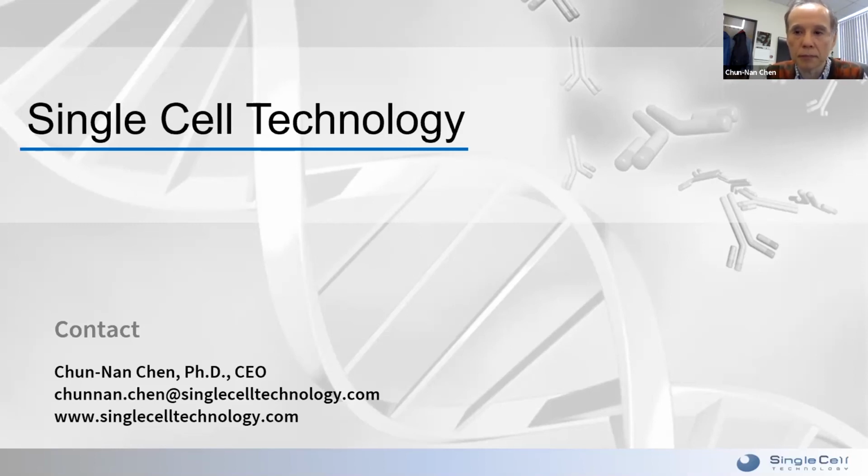Great. And Ching asks, and maybe you had already presented some examples of this in your talk, how do you do functional assays with antibodies captured on the slide? You don't. So all of the functional assays we have is, let me go back here.